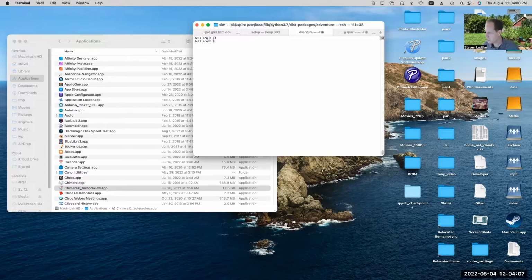There's always a question: is there any point in working with simulated data? And simulated data is a great way to start something out when you're first developing it. It's also a pretty good way to learn how a new tool that you're trying to use works, even if it's not proof that the tool is going to work perfectly in all situations. If it doesn't work on simulated data, then it's probably not going to work on real data either.